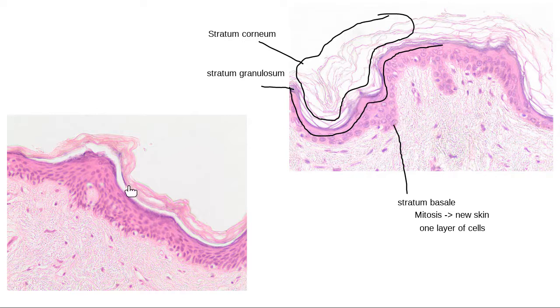We can do the same kind of thing over here. So let me start pointing right here. What would I call this place right here? Circle it, where I put the end of my line. What stratum would we guess we might be pointing to right here? Any ideas? We got 2 votes. Need some tiebreakers here. Stratum spinosum, stratum granulosum. What do we think? Kaylin's mind is blown.